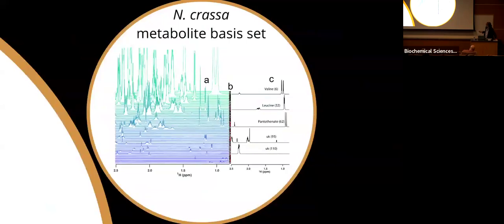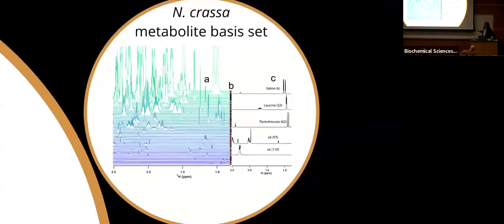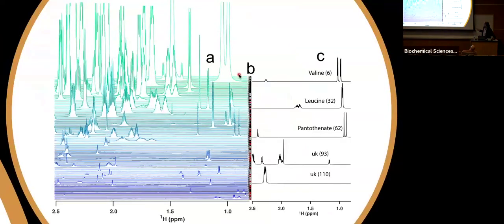So then we get to the point where we have this basis set. Now this looks like the fraction library, but it's not. It is actually ordered from the highest peak at the top to the lowest peak at the bottom.